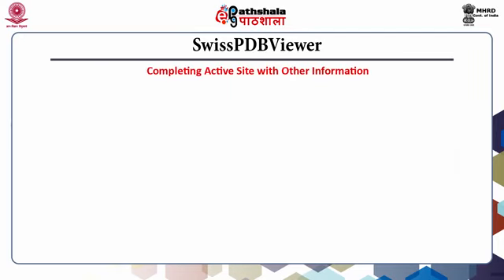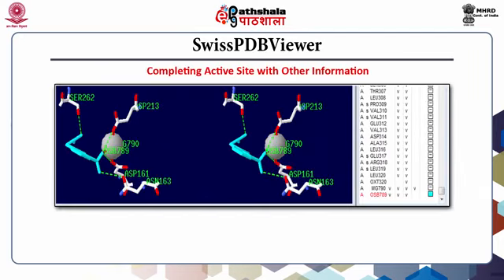From the literature information, we also know that OSBS has a bound magnesium ion. In the control panel, mark V in the first and the fourth column next to Mg790 residue row. This will display magnesium ion as a gray color sphere.